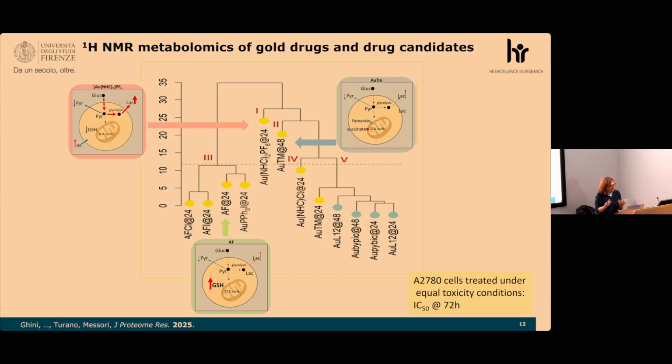And so the nature of the ligands can modulate the affinity for the different types of proteins. Identification of proteins is not an obvious task, so we are trying to combine different omics and also genome scale modeling, trying to understand which could be the target protein. And proteomics and metalloproteomics seem to provide the most interesting aspect.